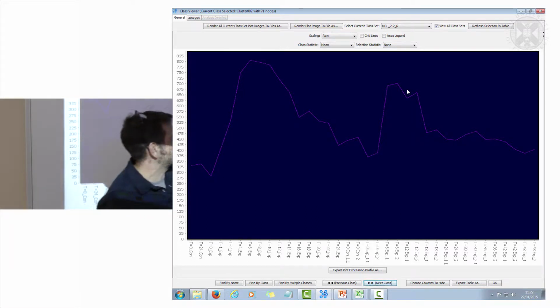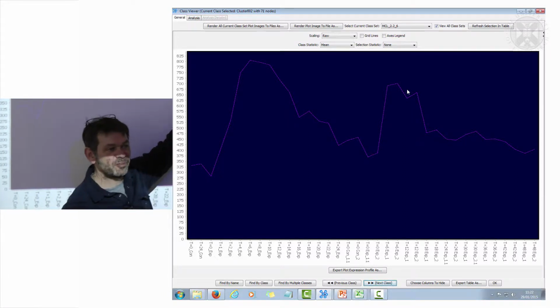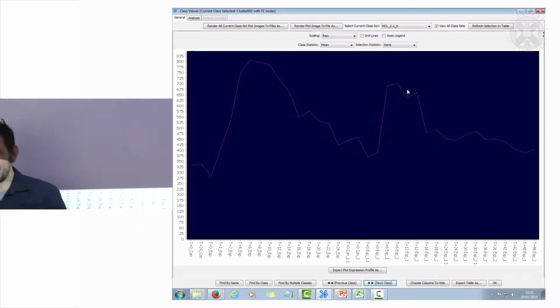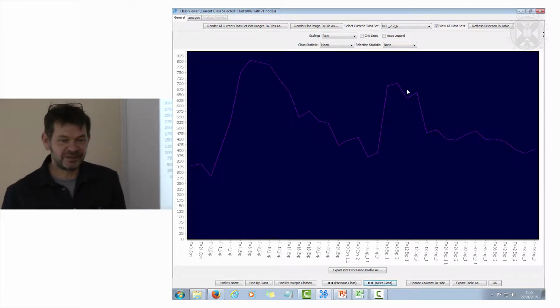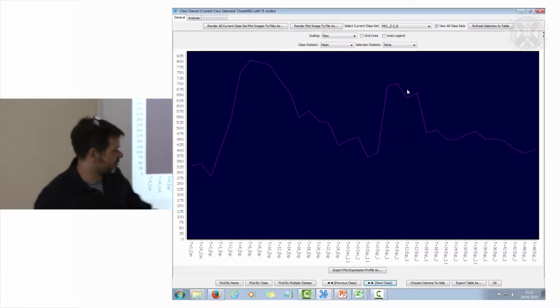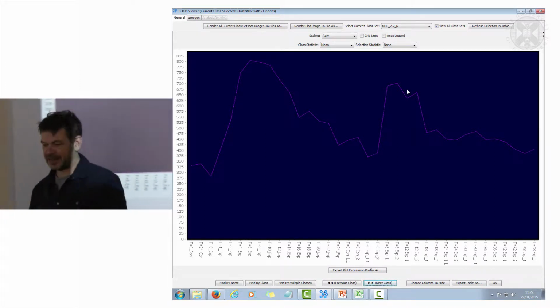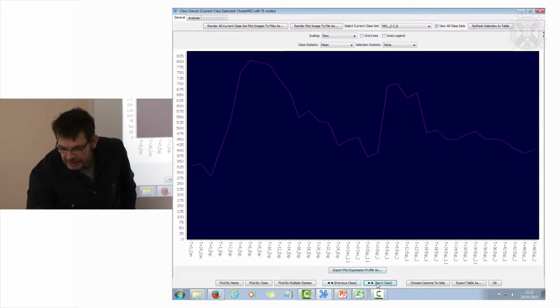When you look at only 6 hours, that could be the peak. It could be on its way down by 6 hours. You don't know, because you've got a big gap of time course where you don't really know any information about those genes. So generally I like to do lots of time points over lots of replicates. And it turns out with this experiment, we learn nothing after 24 hours because everything goes back to asynchronous. Right, just wandering through this data here.